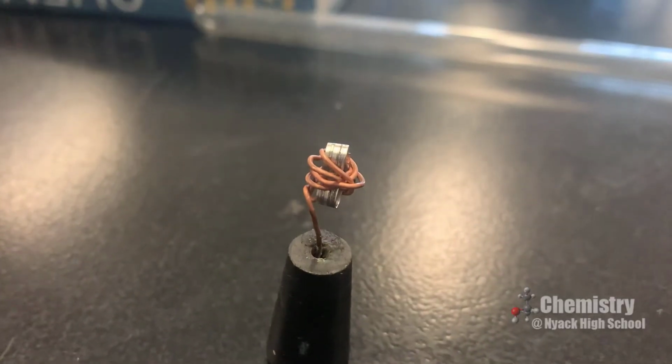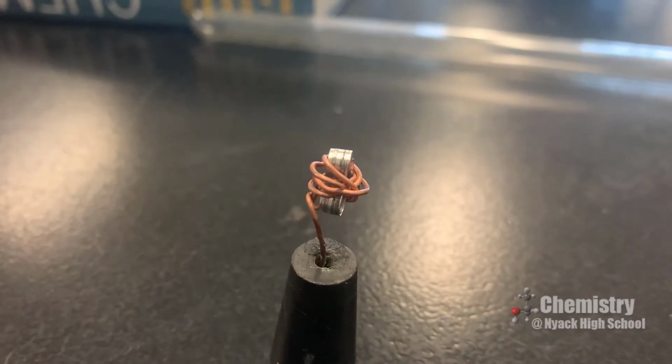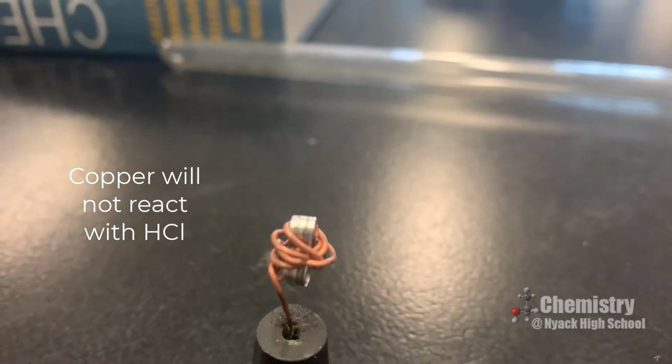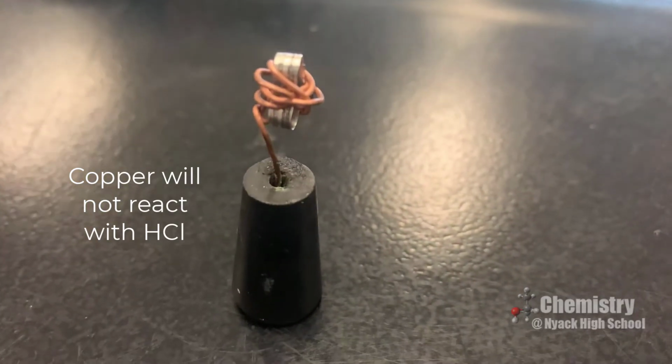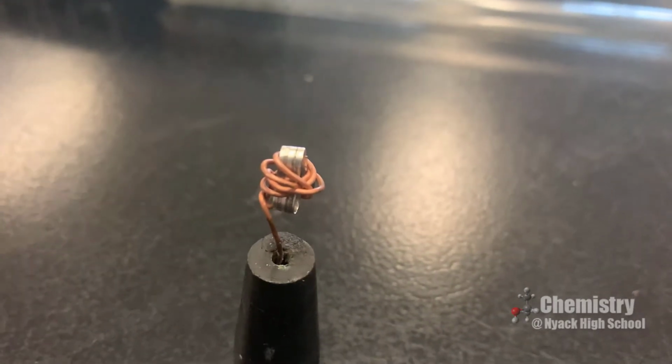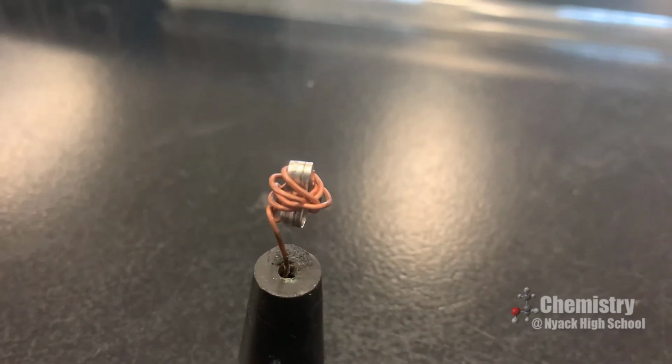And here I've created somewhat of a cage using copper wire to, as best I could, trap the magnesium strip into this stopper so that it will allow the magnesium strip to react with hydrochloric acid.